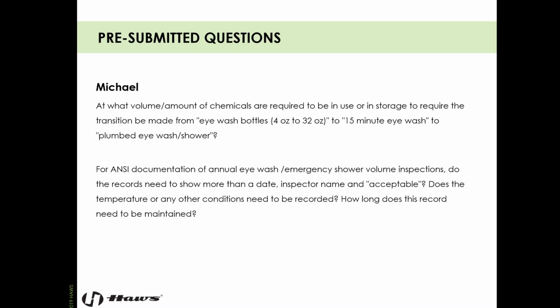Michael asks, at what volume amount of chemicals are required to be in use or in storage to require a transition from eyewash bottles to plumbed equipment?